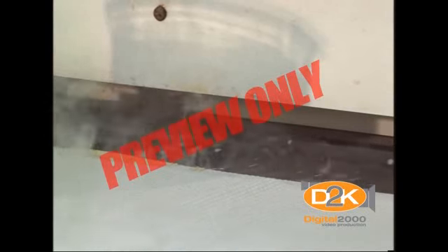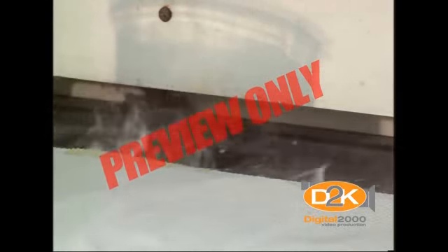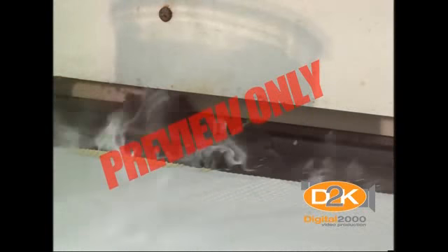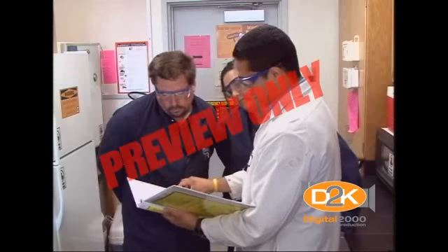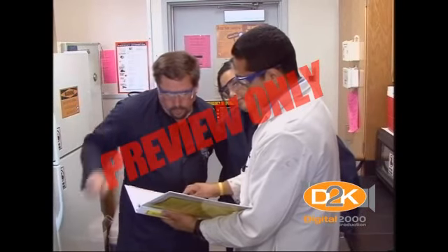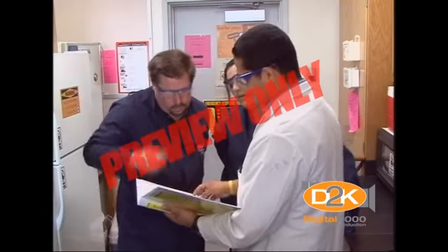Perchloric acid vapors accumulate in ductwork and form perchlorate crystals that have the potential to explode. This can cause serious injury to personnel and damage to property. For more detailed safety information, view the chemical safety program that describes the proper use of chemical fume hoods.